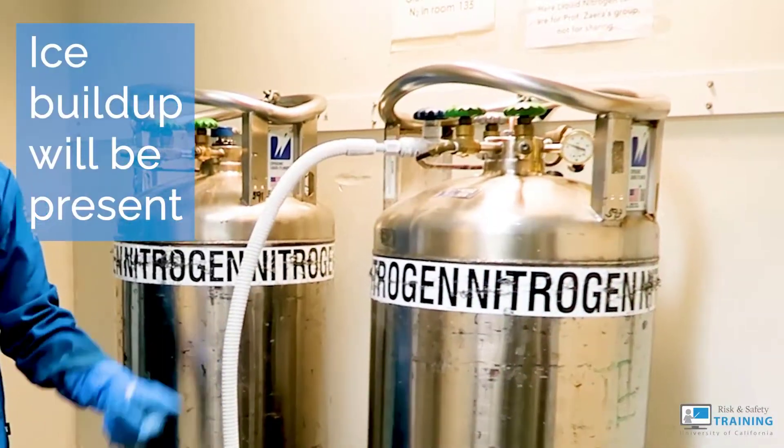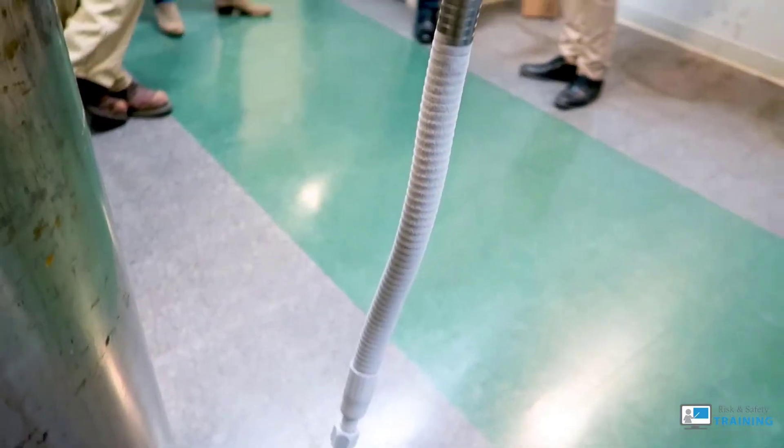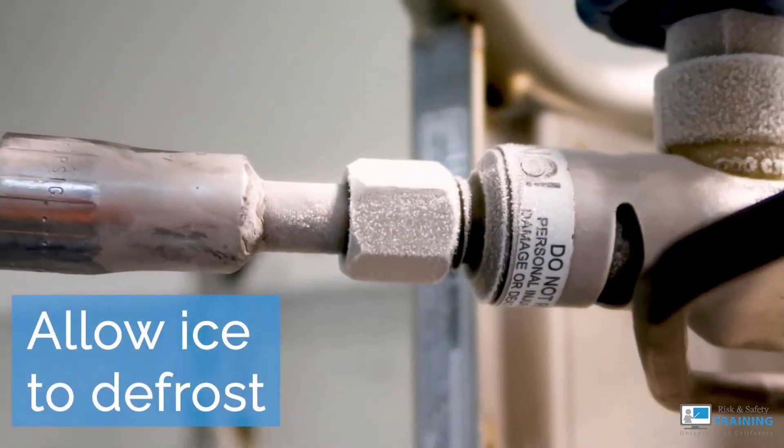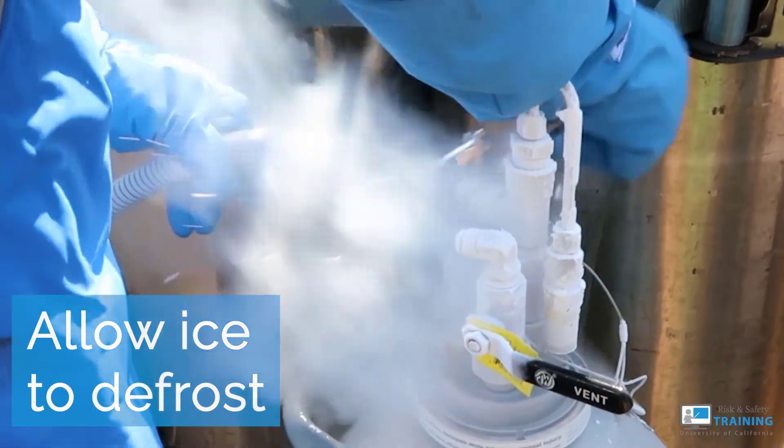Ice buildup will be present, making it difficult to remove. The frost goes away eventually after the valve is turned off. Take a moment to allow it to defrost. Do not hurry this process since it is safer when the ice has melted a bit.